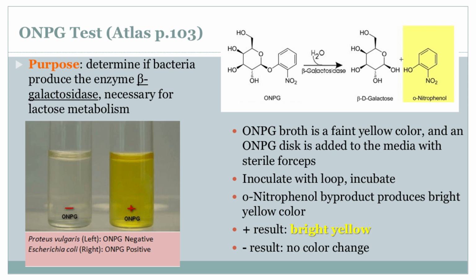And we have to be really, really careful to keep everything sterile. We don't want any other bacteria crashing the party. Right, like those people who show up to a party uninvited and eat all the snacks. Not in our bacteria spa. We need those results to be accurate. For sure. So we use special techniques and tools like a sterilized loop. It's like a really tiny spoon to move our bacteria without contaminating anything.